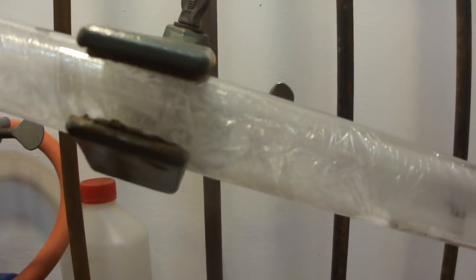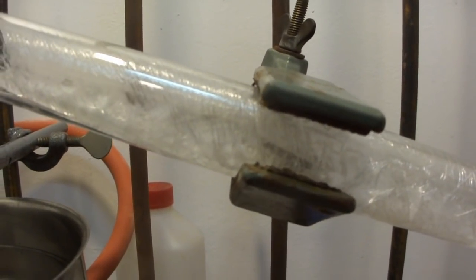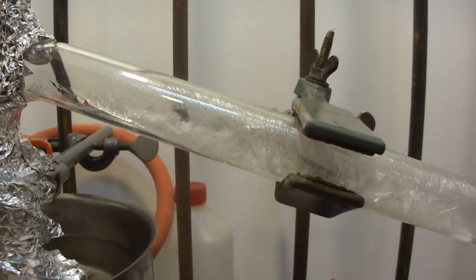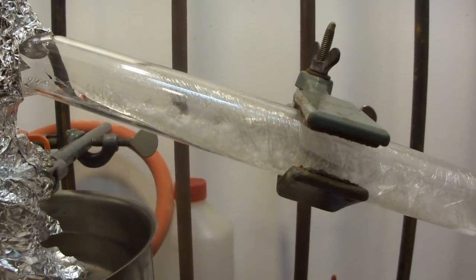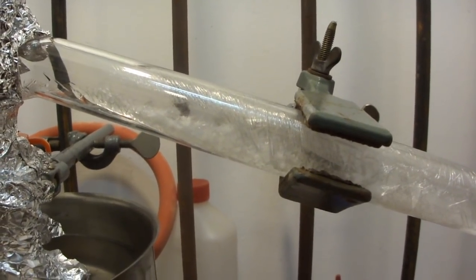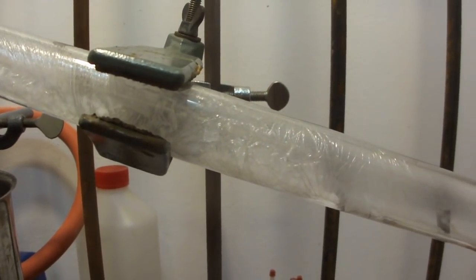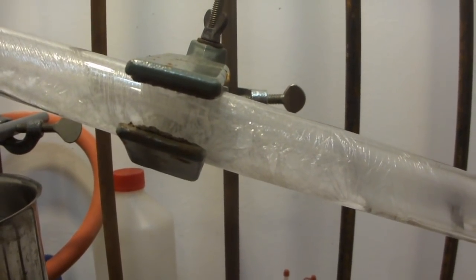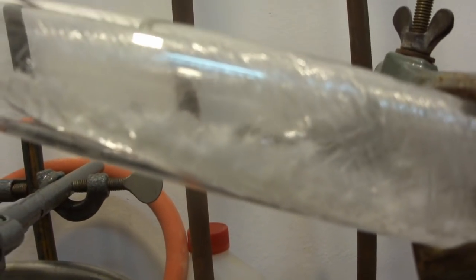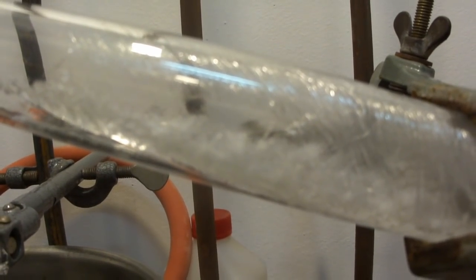Now of course you want to avoid blocking the entire tube, since the apparatus could blow apart, so just as a note for the new ones out there. But since this tube is pretty large in diameter, I don't see any risk of that happening anytime soon. But of course, if you get excessive crystal buildup in the tube, you have to act and use the heat gun to just melt it down.